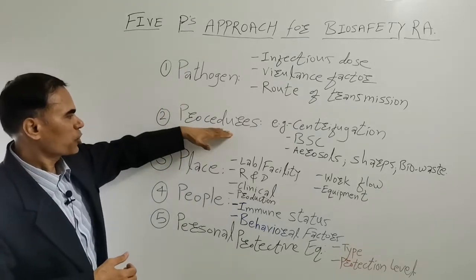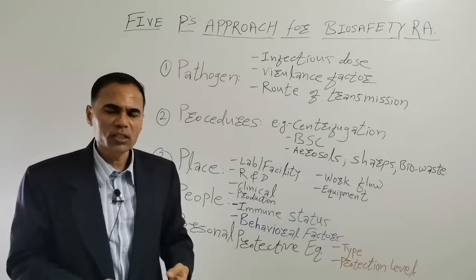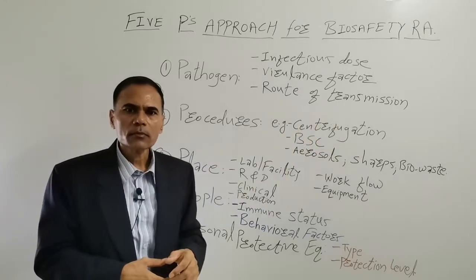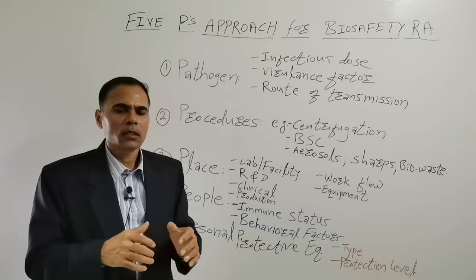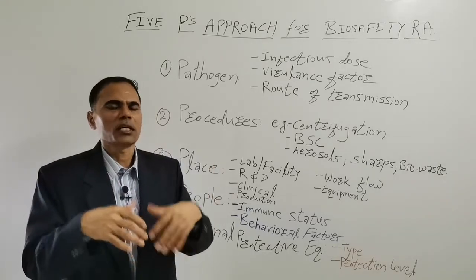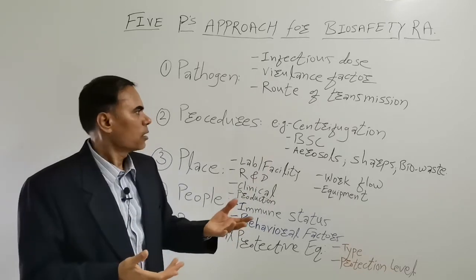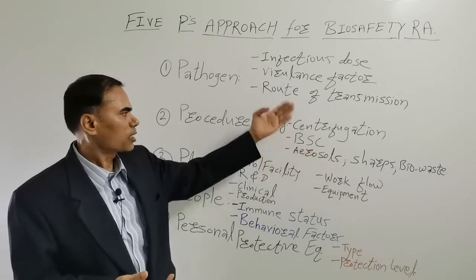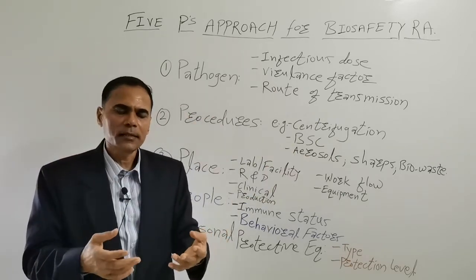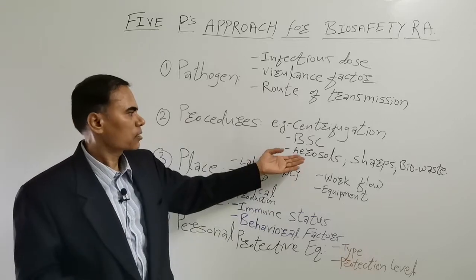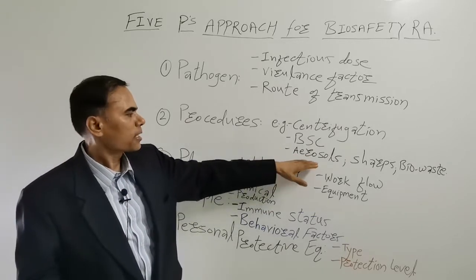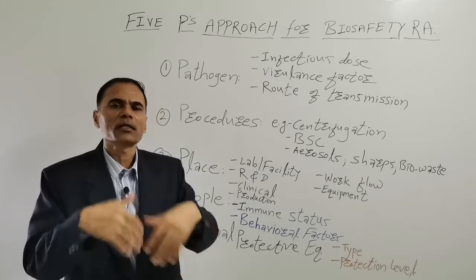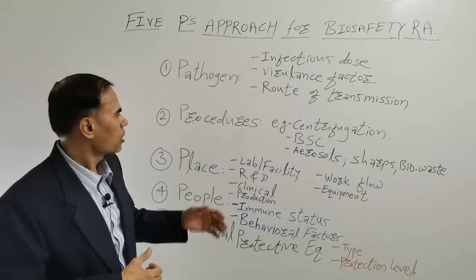The second P stands for Procedures. There are a number of procedures in your research and development activities. For example, you need to consider centrifugation, because when you are using centrifugation there is a possibility something unpleasant can happen. You need to consider whether aerosols are generated and what mitigation measures you need to take, what types of sharps are present in the procedure, as well as what type of biological waste is generated and how you are disposing of that biological waste.